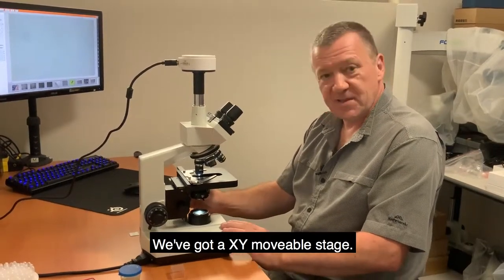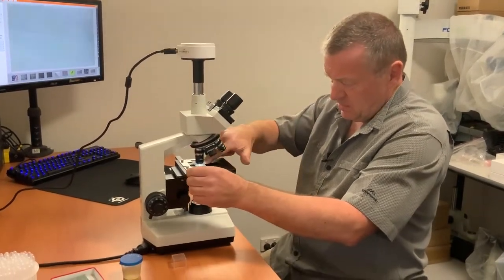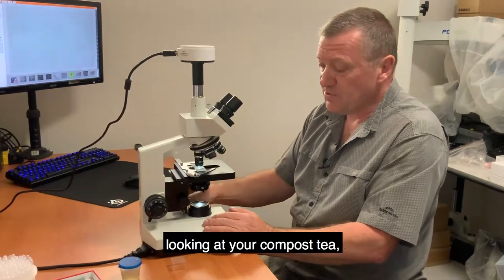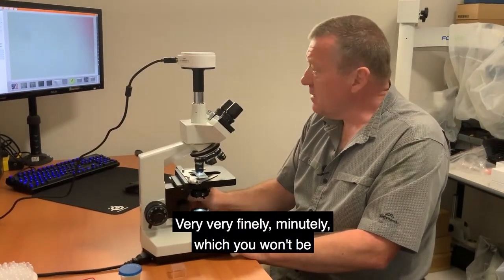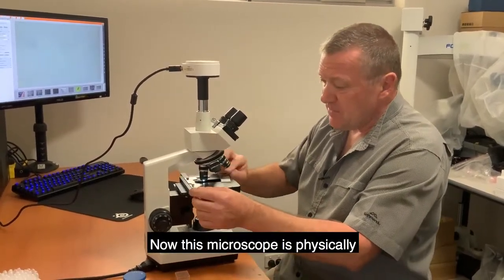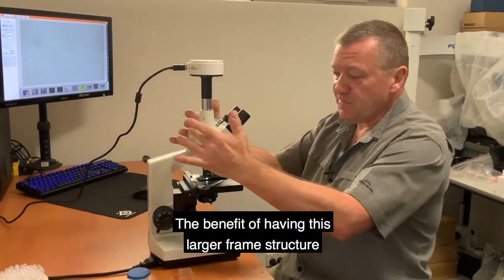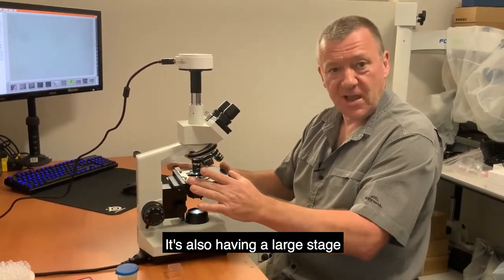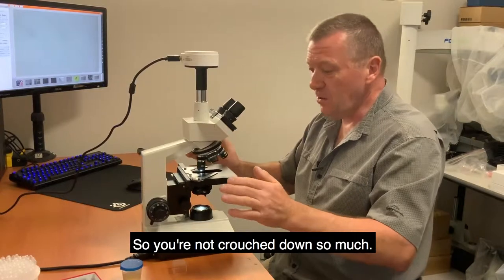There is an XY movable mechanical stage, which is very important. When you put your slide on the microscope and you're looking at 400x magnification at your compost tea, you need to be able to control movement very finely and precisely — which you won't be able to do without this mechanical stage. This microscope is physically quite large; you can buy smaller frame microscopes, but the larger frame gives you more comfort, a larger stage plate, more movement range, and keeps you from crouching down.